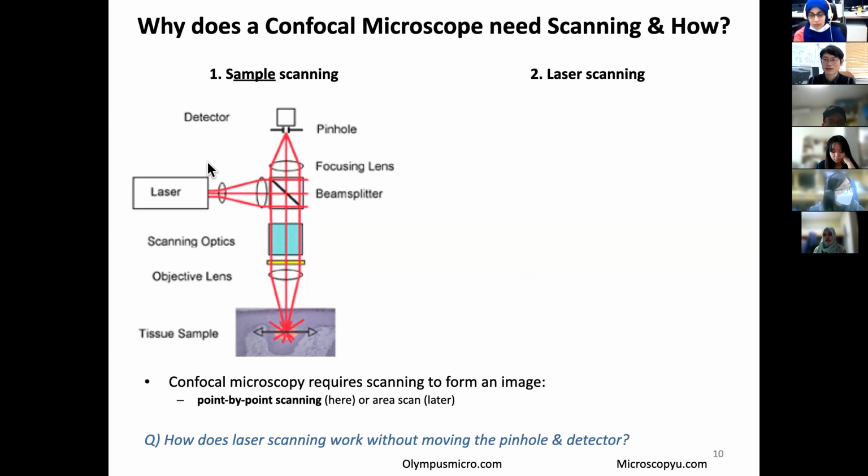This is simple and nice, but it is good for proof of principle. In a real system, for example, when you are doing in vivo imaging, or you have cells on a plate, you don't want to move the cells with XYZ scanning. So this is great and simple as a proof of principle, or when you write a paper, but in practice, that's not the right way.